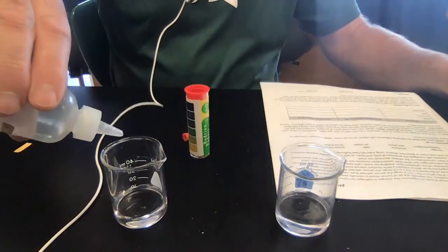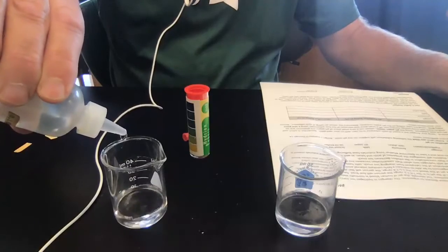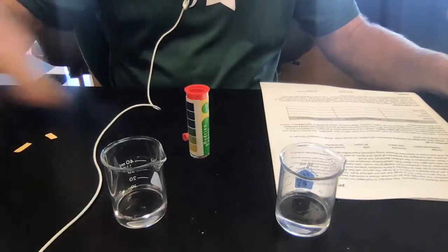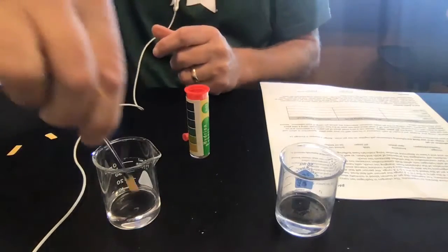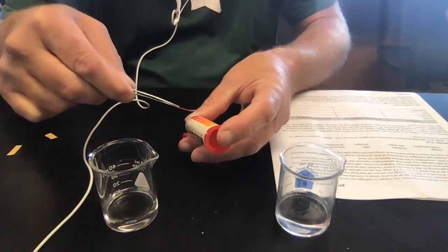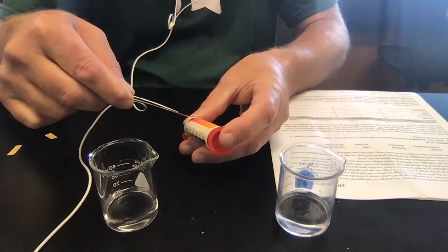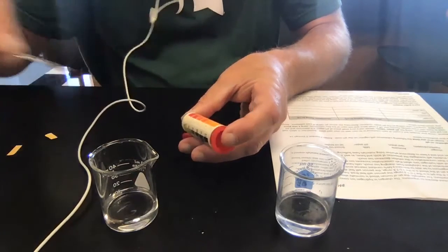And I'm going to add 10 more drops. 9, 10. I'm going to swirl that again. I'm going to take the pH. And that's become even a darker red. That's close. I'm going to call it pH 1.